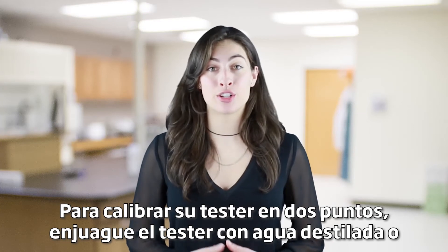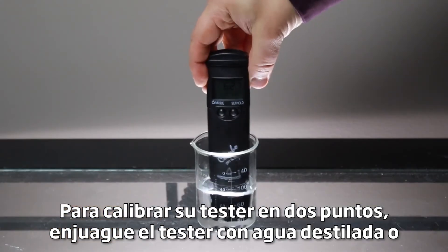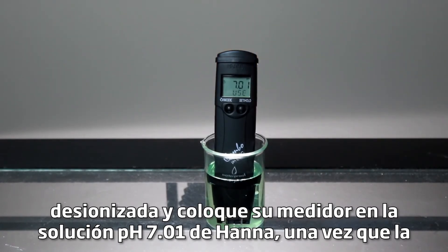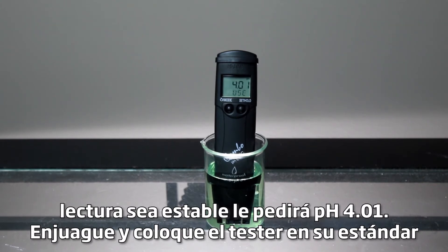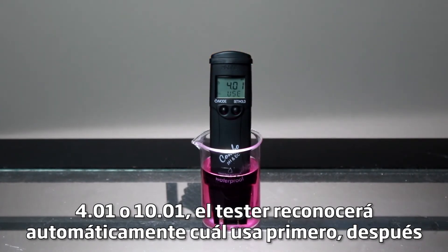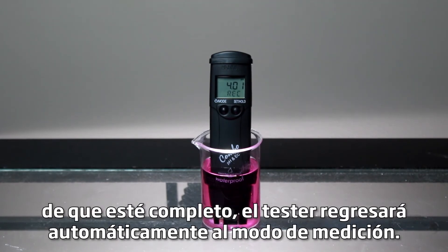To calibrate your tester to two points, rinse the tester with distilled or deionized water and place the tester in your HANA pH 7.01 buffer. Once the reading is stable, it will ask you for pH 4.01. Rinse and place the tester in your 4.01 or 10.01 buffer — the tester will automatically recognize which one you use first. After it's complete, the tester will automatically return to measurement mode.